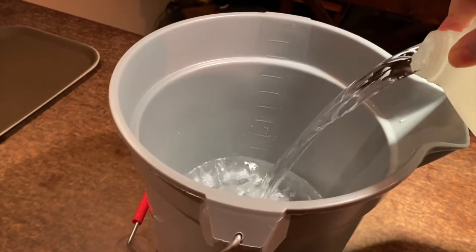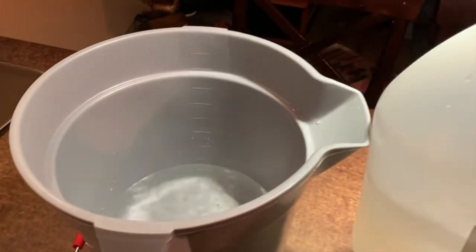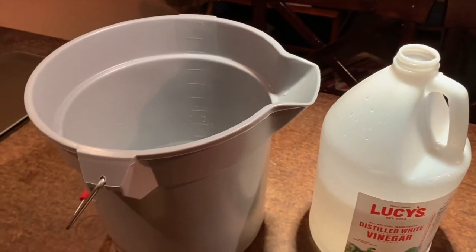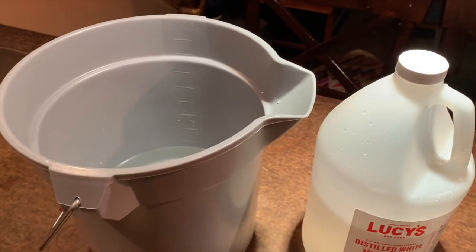Another operational issue is containment and disposal, which is best prepared in advance, not improvised later after we already have gotten started and have corrosive liquids all over our hands. What I've prepared here is a bucket with a large volume of vinegar, which contains about 5% acetic acid in water. Acetic acid is weakly dissociating, so it provides a large neutralizing buffer for whatever alkaline hydroxide we add to it.